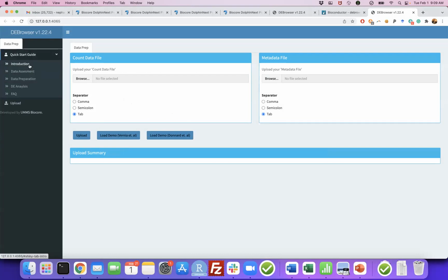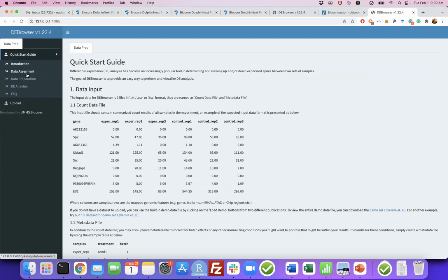There are some tutorials here. Your table should be something like this. You have your gene names, and on the columns you have your samples, and these are the count values. Even if they are not integers in your file, we convert them to integers. In this case, these values are coming from RSEM. I told you before, these values are calculated using a likelihood function. That's why these are not integers, but they're supposed to be integers.